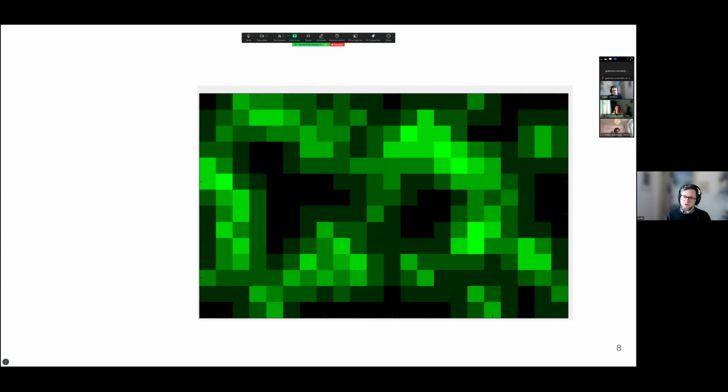Here is actually the core of deconvolution. We would like to go from images like this back to at least the pixelated version of the image, and maybe with some other techniques for spot fitting and so on, you could even find the subpixel locations of fluorophores. So is this possible? How could we reverse this procedure to get back to the sharp pixel map? As you know, of course, it's doable, and surprisingly enough, it's doable even by hand.